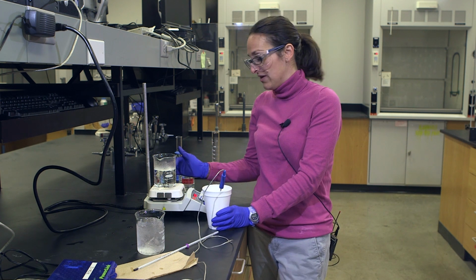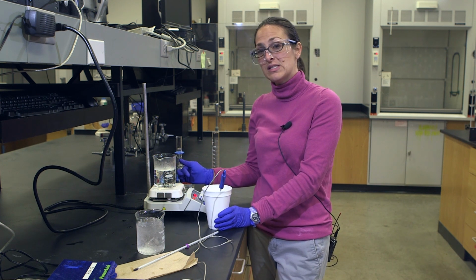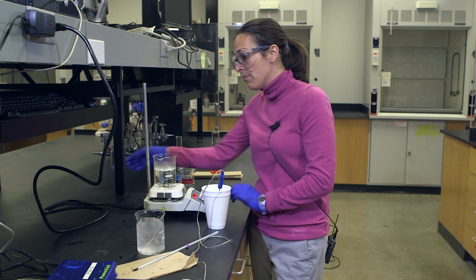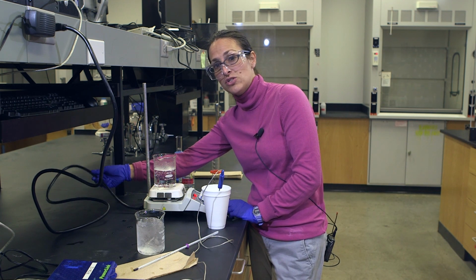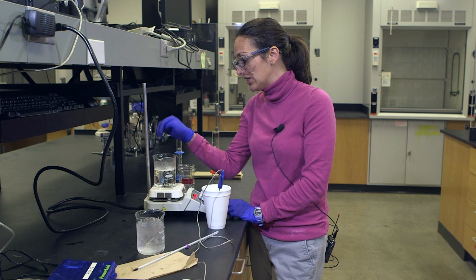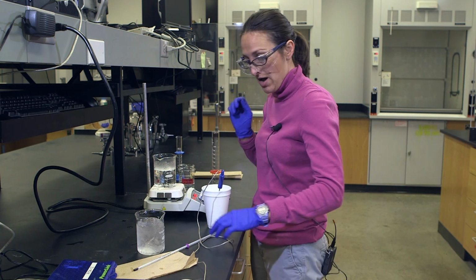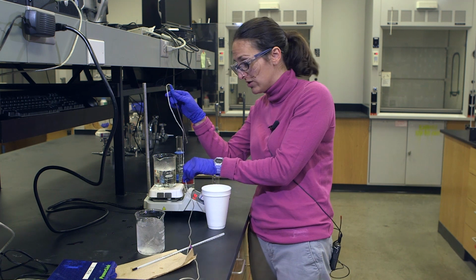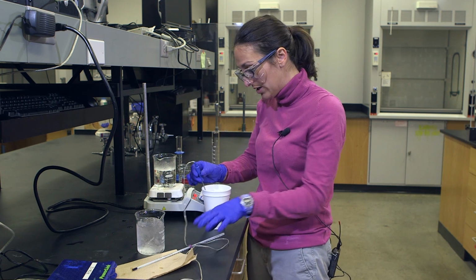For experiment 11, we need to be careful because, I should point out with our hot plate, this ceramic white surface is very hot. So not only do you not need to touch it, but be careful of all the cables. Make sure there aren't any cables touching the hot plate surface. If you're using your temperature probe over here, make sure that you aren't going to melt the cord.